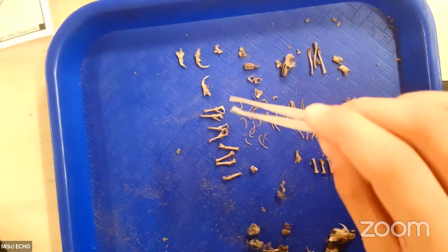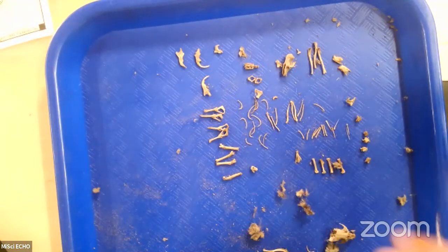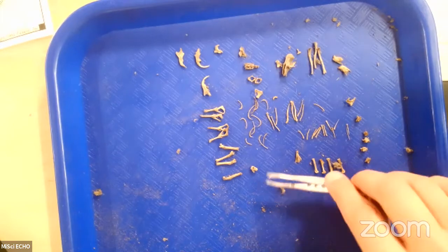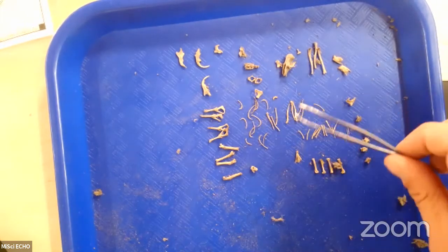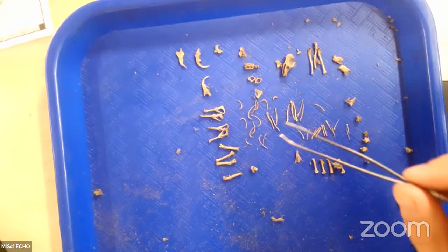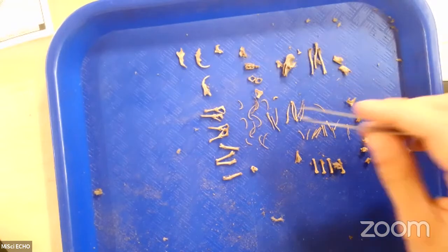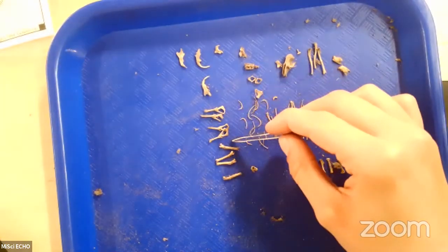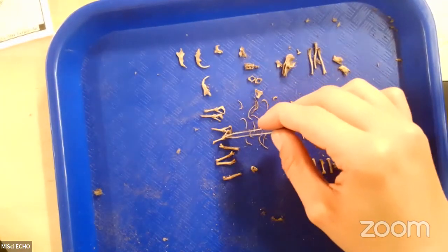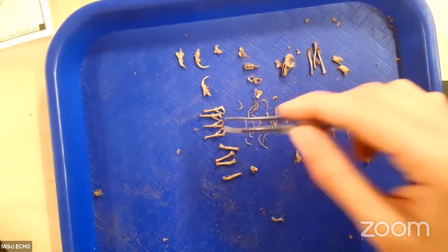In each organism, we only have 2 pelvic bones. So there are at least 2 different organisms inside this one owl pellet. So this owl ate at least 2 smaller organisms, which is really interesting to find out. But if you look around, these pelvic bones all kind of appear like they came from the same type of animal, so possibly all rodents, 1, 2, 3, 4.